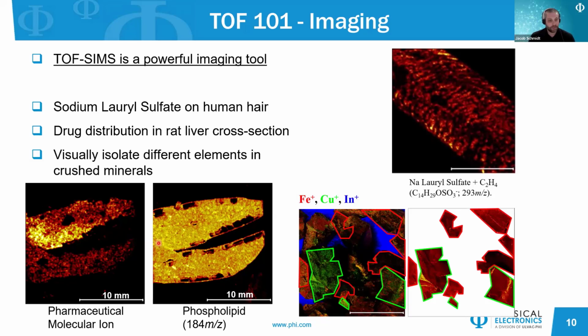TOF-SIMS is also used in the mineral industry. And in this case, we have some minerals, and we can isolate individual elements in those minerals to determine which domains those elements are in.